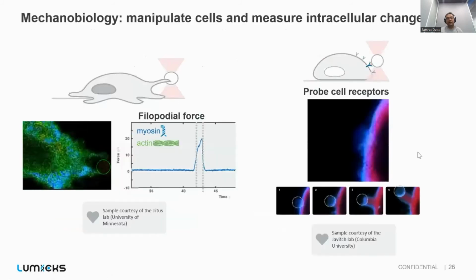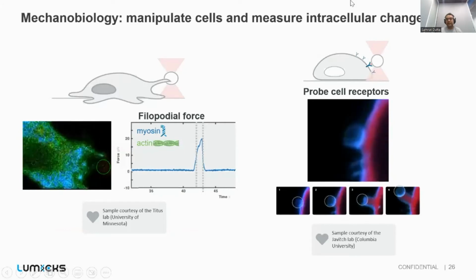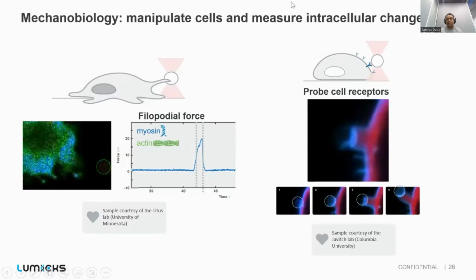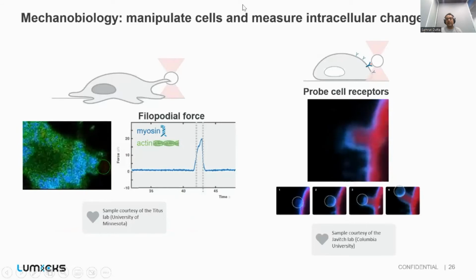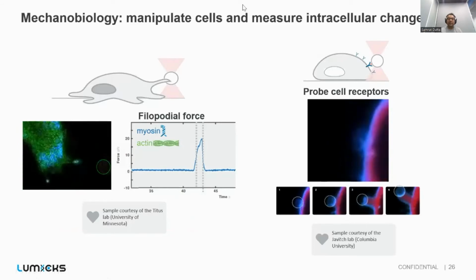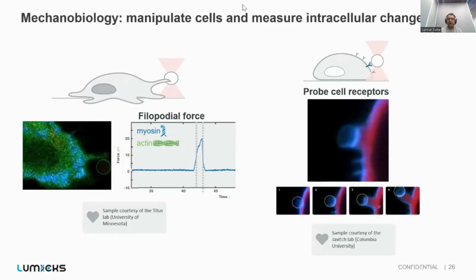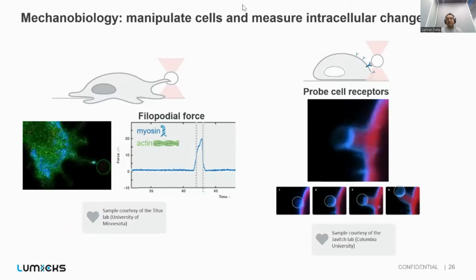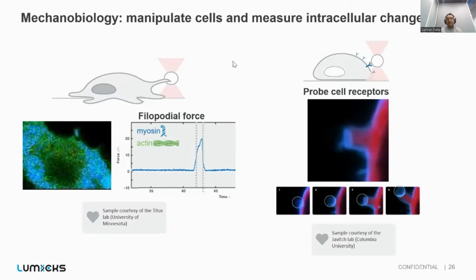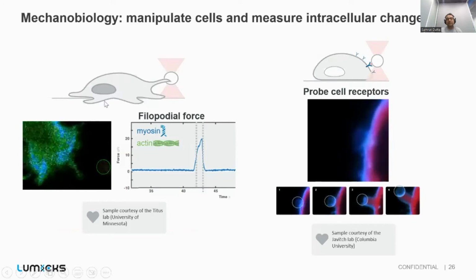And finally, I will just share this slide with you because I'm not going to talk too much about it, because Yen is going to talk more about the mechanobiology part. As we know, cells move. When a cell moves, it might anchor along its way to other components in the microenvironment, and this anchoring depends upon the elasticity or the stiffness of this particular cell.